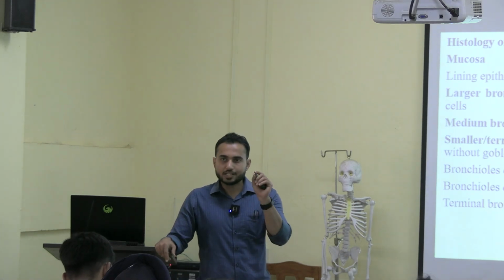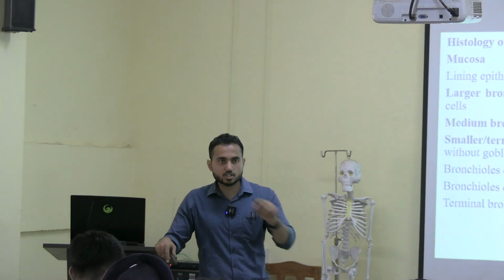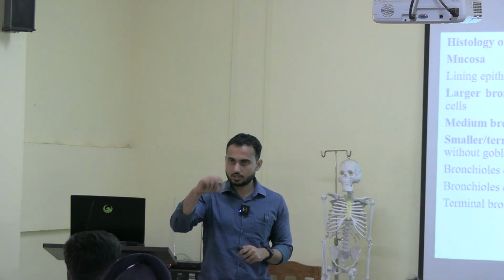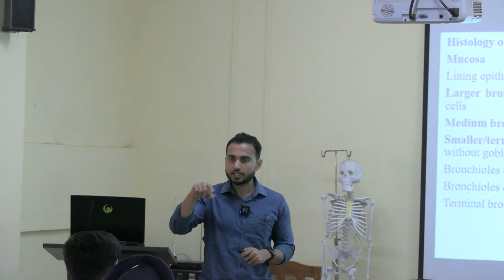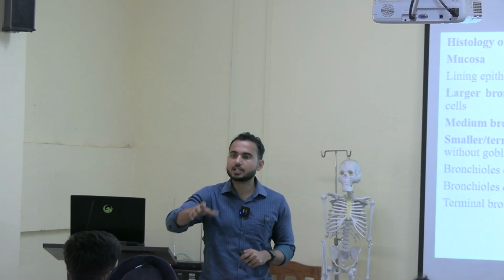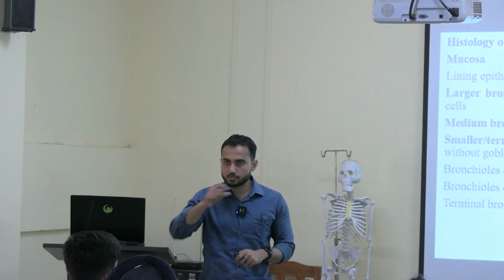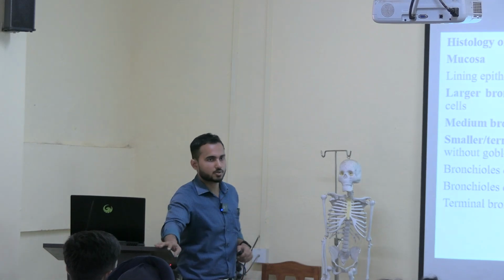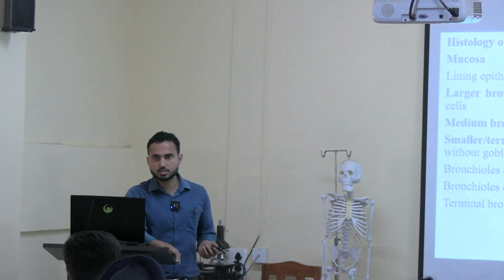Listen, जो respiratory bronchiole होता है, it leads towards the alveolar duct, and alveolar duct से alveoli में opening होता है. So you have to find out that. Okay, so like this you can identify the respiratory bronchiole. Don't worry, we'll see all those things today.